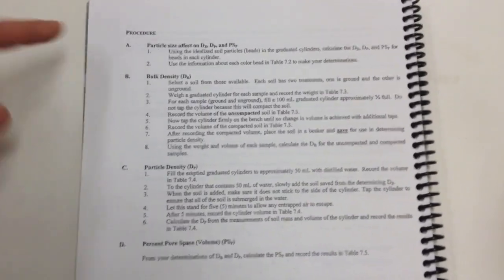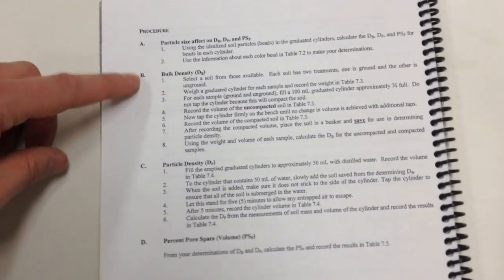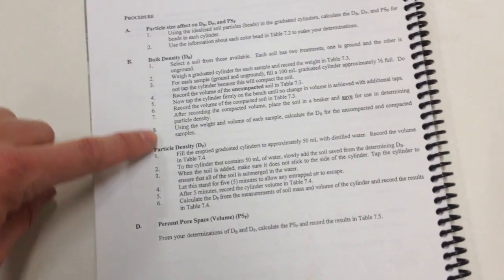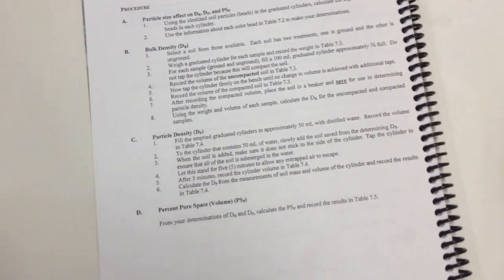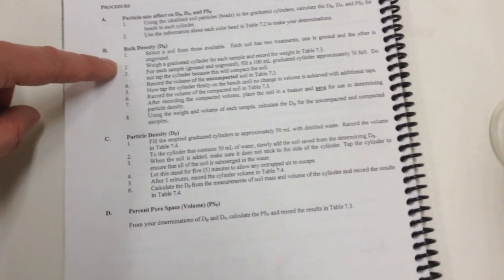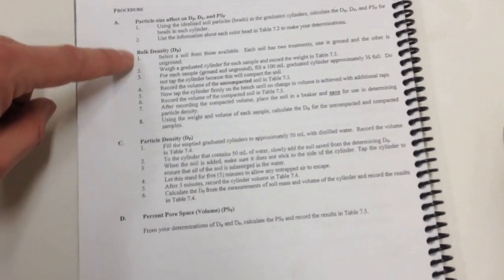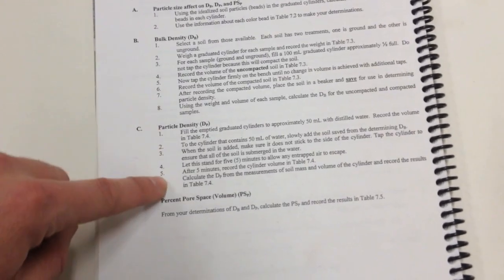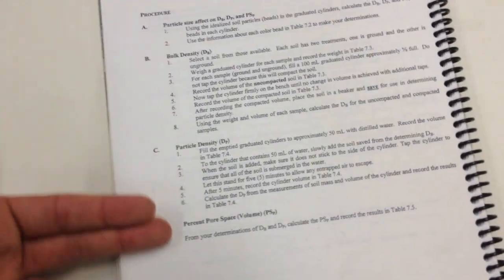Your lab manual looks like this. Here's procedure A, which you're not going to do. Procedure B is what you need — you're going to go completely through this with your unground soil, and then completely through it again with your ground soil. So you do one version through bulk density and then completely through particle density with your unground soil, then clean the graduated cylinder and repeat with the ground soil.